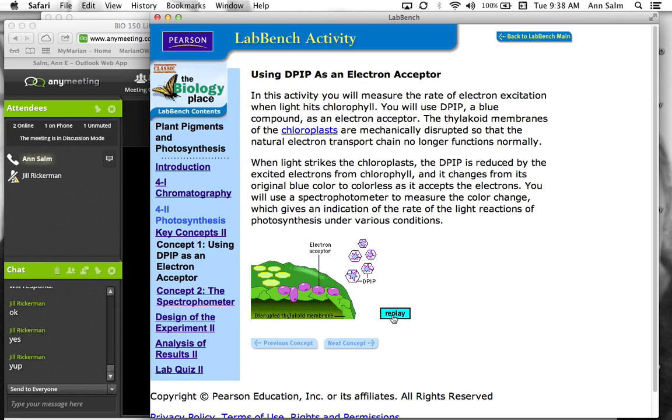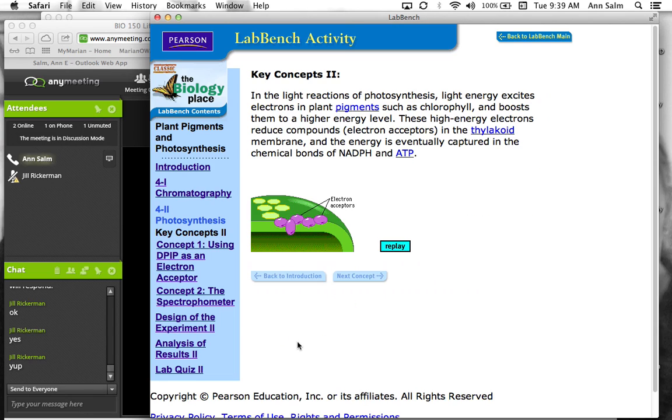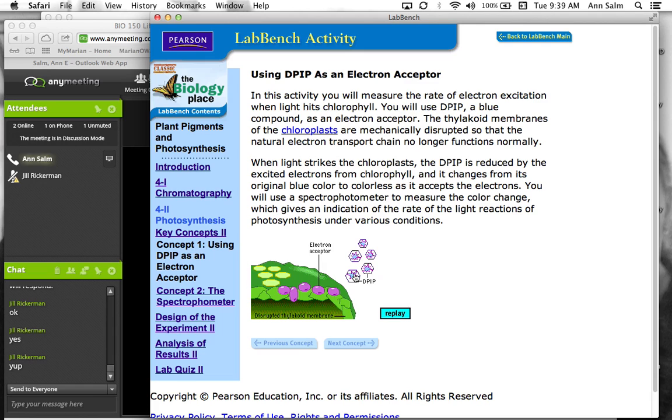So I'm going to go ahead and replay that. So in the experimental tube, we'll have these spinach leaves put in an environment where they will be conducting photosynthesis. And I wonder if, it looks like it doesn't want to replay it like it's supposed to. So let me just go ahead and, for some reason it's just not working to replay it.